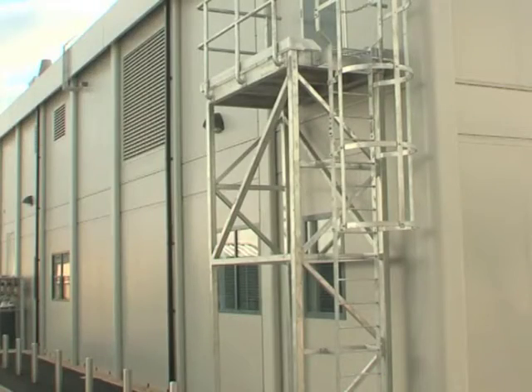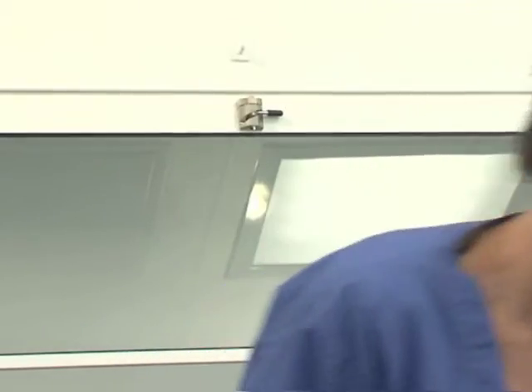Biocontainment facilities have a very high degree of inbuilt protection for personnel working with pathogens. Personal protective equipment, or PPE, acts as a barrier to minimise the risk of exposure to aerosols, splashes and accidental inoculation. But never forget, it is not a substitute for good laboratory hygiene and practice, and is considered lastly once all other control measures have been considered and put into place.